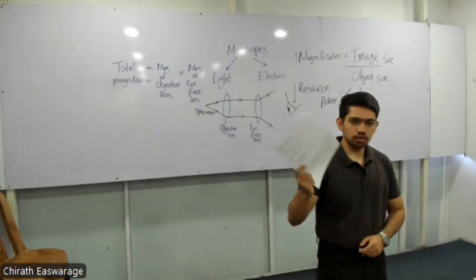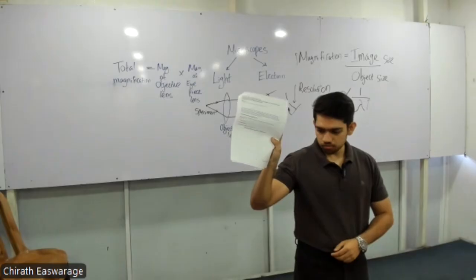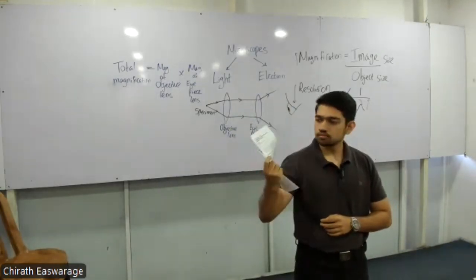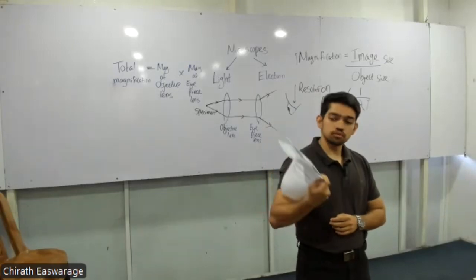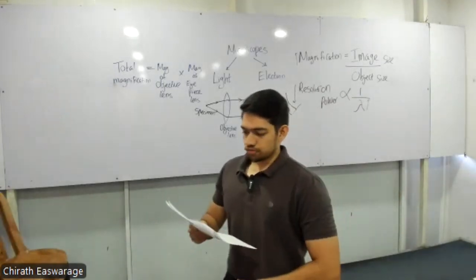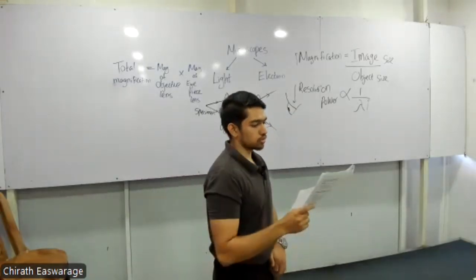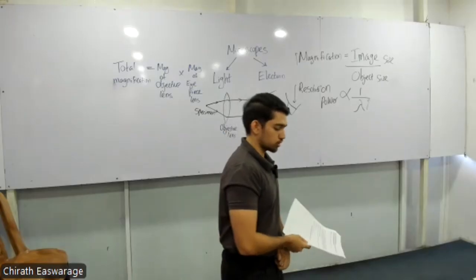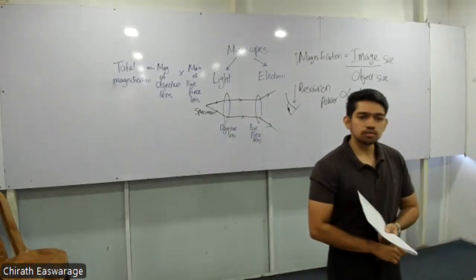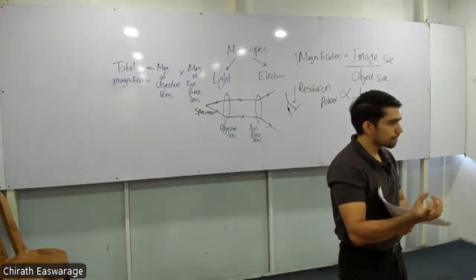So now we can move on to the light microscope practical. Okay, take out the practical tute now, page number 3. Parts and functions of the light microscope and the use of the microscope to observe specimens. All light microscopes have 3 basic components. What are they? So now you know. Name some important components.